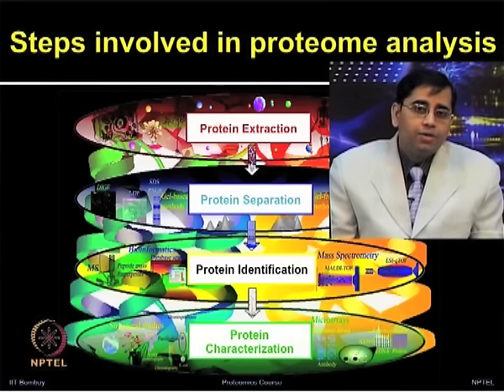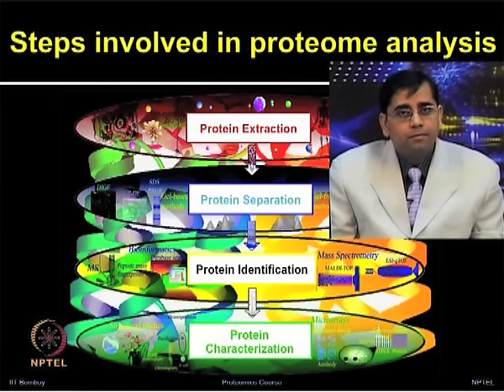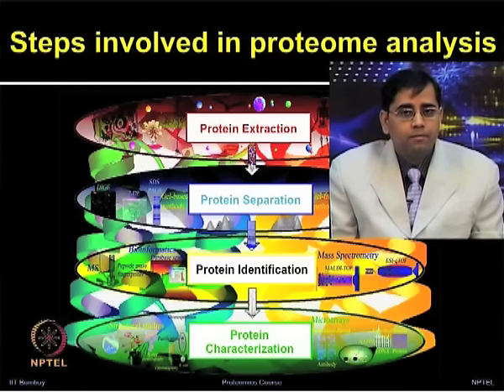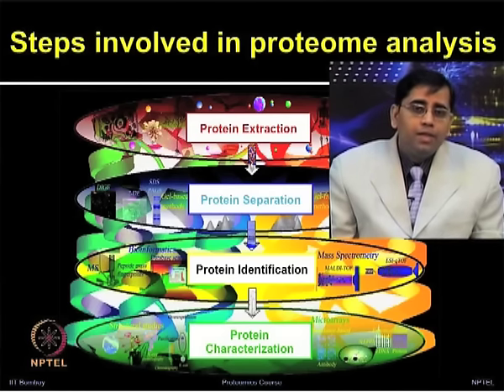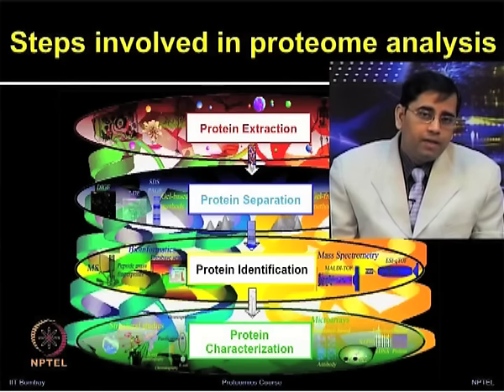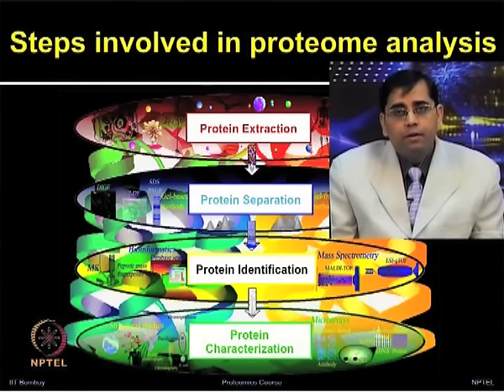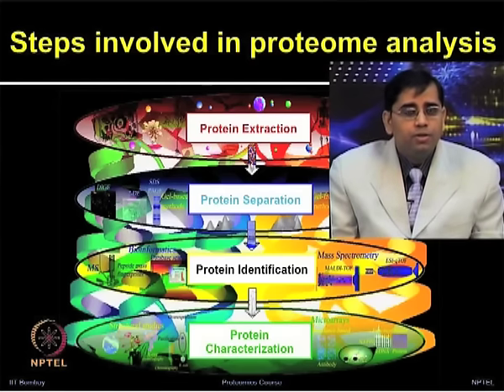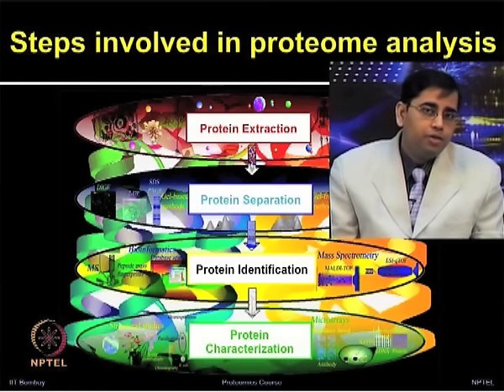Protein extraction from whole cells, tissue or organism is the first requirement for proteome analysis. Protein separation and quantification is achieved by various proteomic techniques, including gel based techniques such as two-dimensional electrophoresis and gel free techniques such as iTRAQ mass spectrometry based techniques.